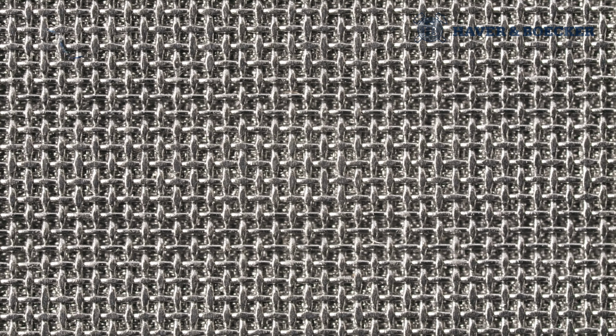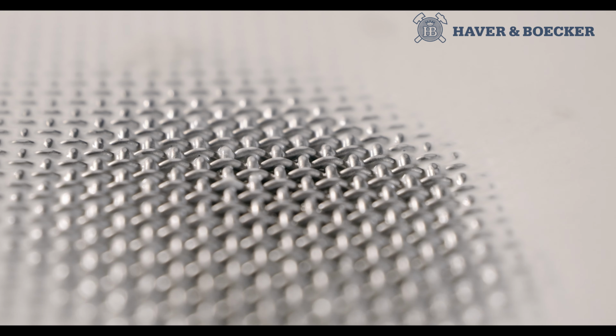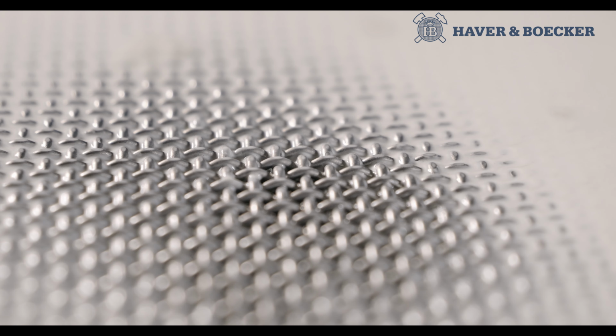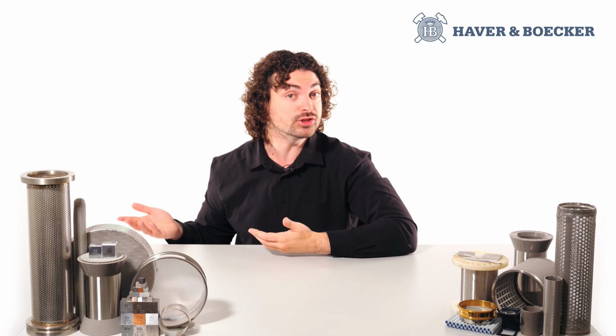Restricted open areas or uneven pores force fluid through the screen at high velocities, creating a jetting effect and turbulence that distorts the sample plug. Conversely, a high open area with a uniform grid pattern ensures a smooth fluid transition across the column diameter. This minimizes physical obstructions, equalizes path lengths, and keeps sample molecules moving in narrow bands.